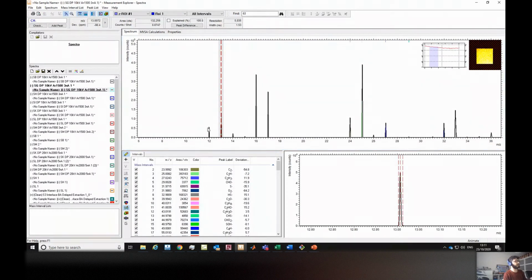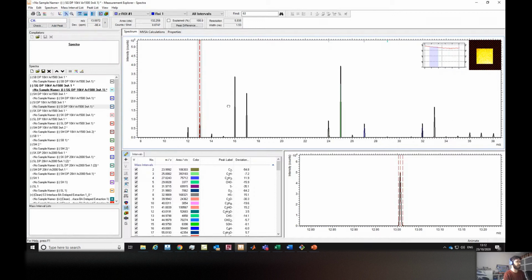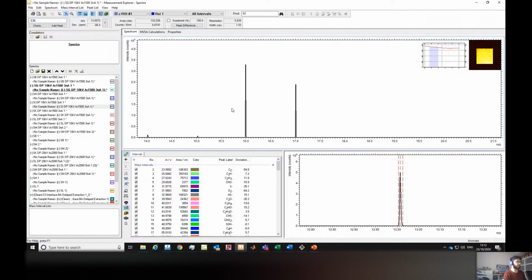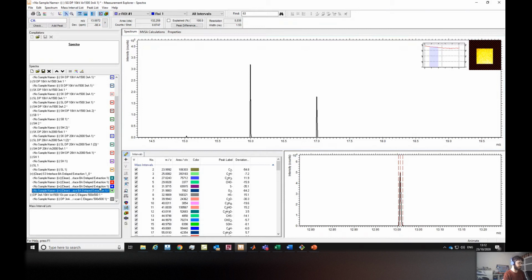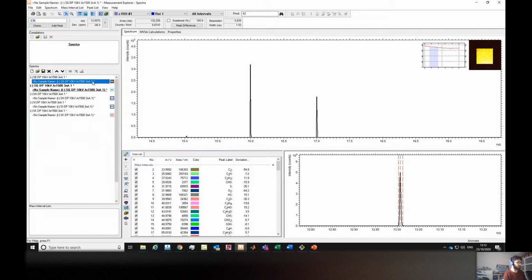So the workflow: basically, I have several measurements, and each of those here is a separate depth profile. I won't be covering much of this today, but basically you have to make a peak list. Assuming that you know how to do this, otherwise we'll leave the links for the other workshops where we cover this. But the quickest way, without going too much into detail, to make a pick list that will have the areas of interest of all your data sets is to have an overlay.